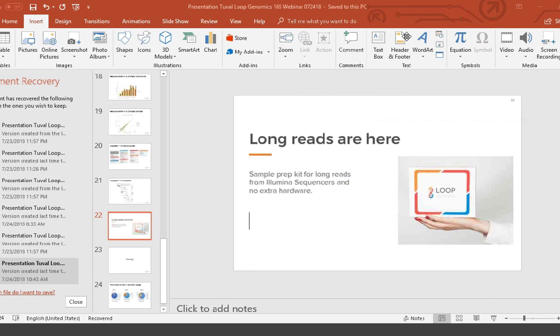Next question, does the DNA need to be sheared before ligation of that adapter, or does the adapter include the cutting site that specifically recognizes the start of the 16S gene? Yeah, that's a great question. So the answer to that is that you don't need to do anything. You don't need to shear or anything. The input into the kit is simply extracted microbial genomic DNA. The kit includes everything that you need in order to target the 16S gene. There's no shearing required on your end.